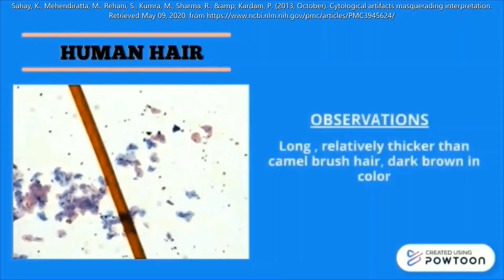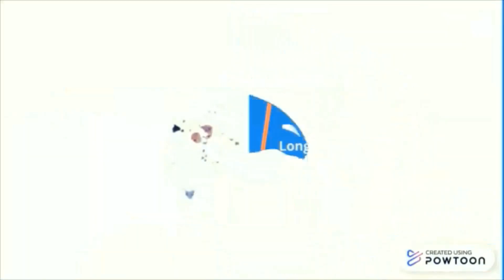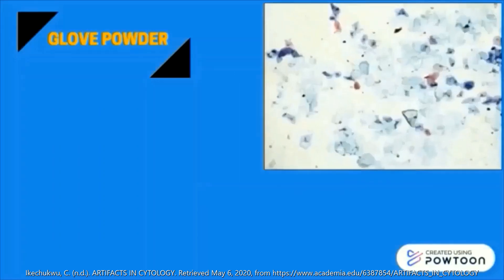Human hair is long, relatively thicker than camel brush hair, and dark brown in color. The next artifact is glove powder.